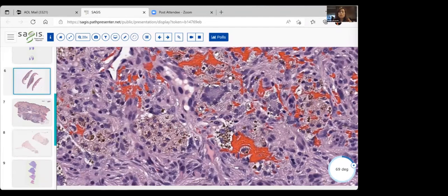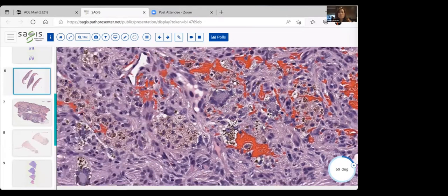When you have multinucleated giant cells, histiocytes, taking up iron, or hemosiderin, you can call them siderophages. So these are siderophages, and when they are lipidized, you can call it a lipidized siderophage. And some people will call the formation of multinucleated giant cells in this wreath-like or ring-like structure, here comes, ringed lipidized siderophages. And ringed lipidized siderophages are a hallmark of a type of dermatofibroma, here the aneurysmal type of dermatofibroma.